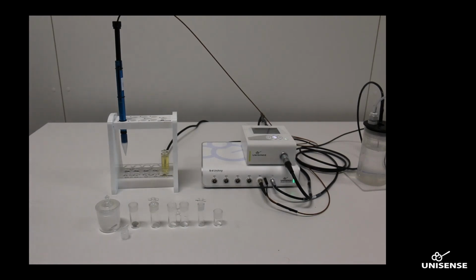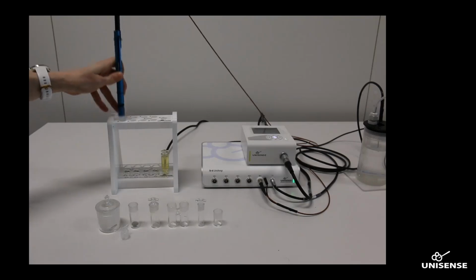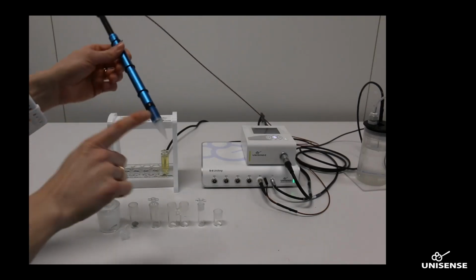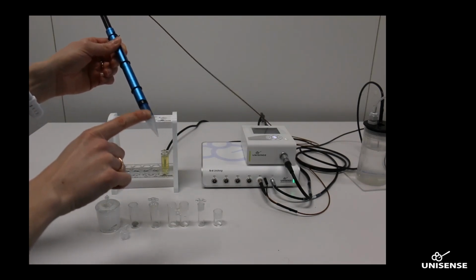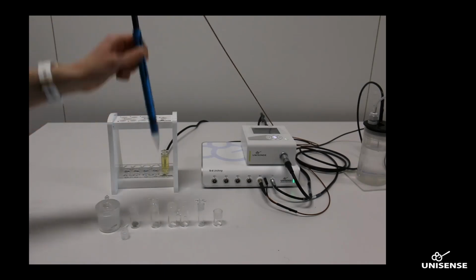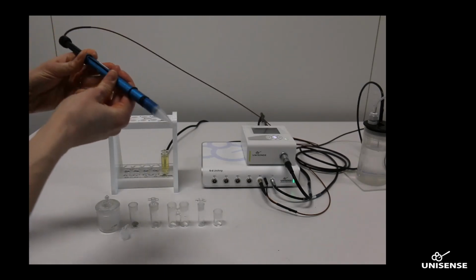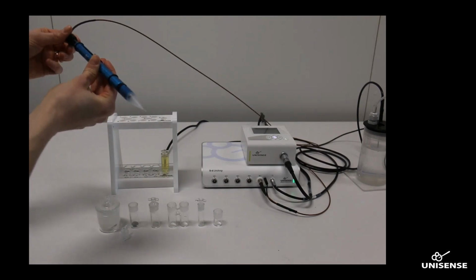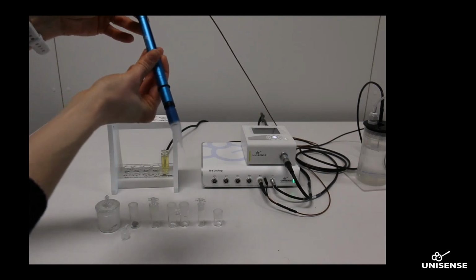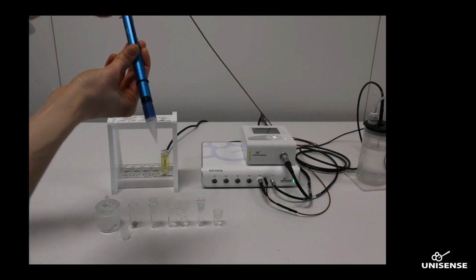I hope that you can all see the microrespiration system here. I will just again show you the sensors. They are all mounted in this blue aluminum guide that has a plastic cap at the end. And this cap ensures correct insertion into the lid of the chambers. When you have positioned the sensor in the lid of the chamber, you can then take out the sensor tip, and it will then measure inside of the chamber. When you are going to move the sensor between samples, you can retract the sensor tip and protect it.